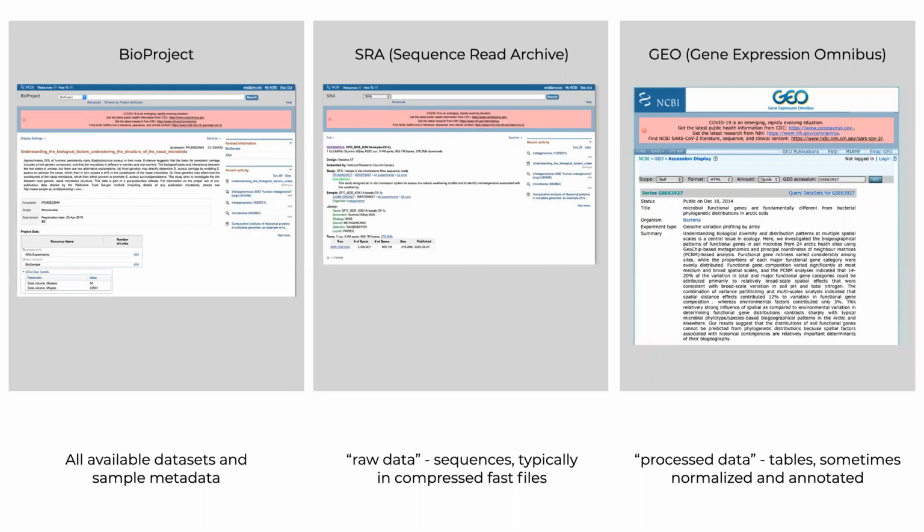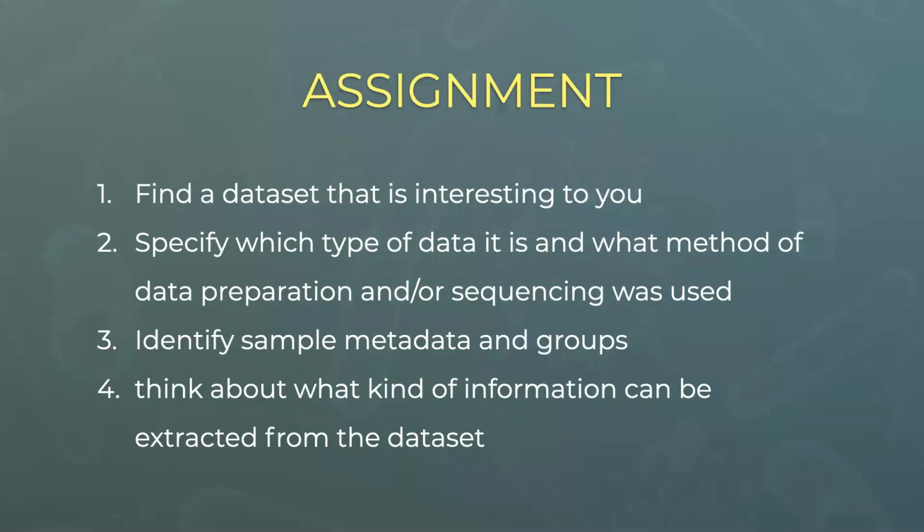Okay, great. So we'll look at that, Dr. Barca. I have a few examples, but before I jump to my examples, let's see if anyone was able to find a data set that was already interesting. So if you did find a data set that is interesting to you, just paste in the link to the data set, and we'll take a look at some of these data sets.